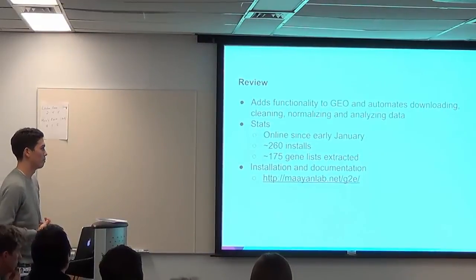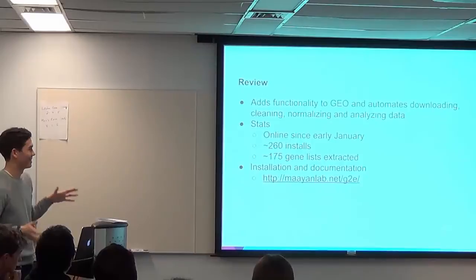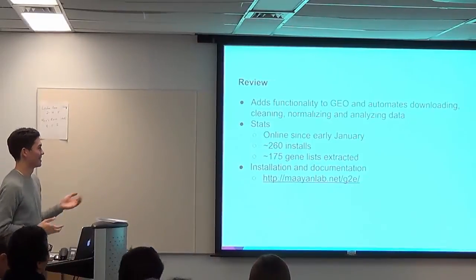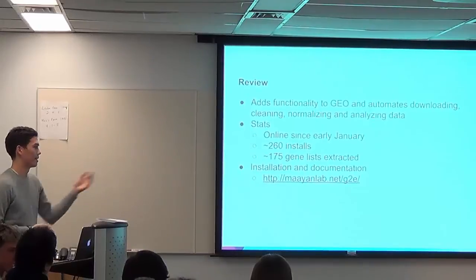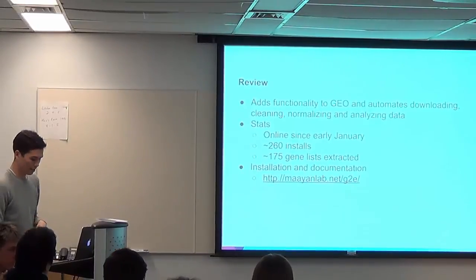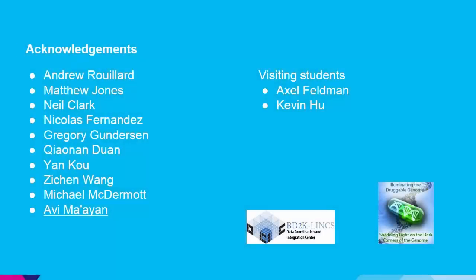It's been online for about 10 days. So get in while it's not cool yet. 260 installs, about 175 gene lists have been extracted, and there's the link if you're interested in using it. Which I hope you are, and definitely send me plenty of feedback, and do complain when things don't work.